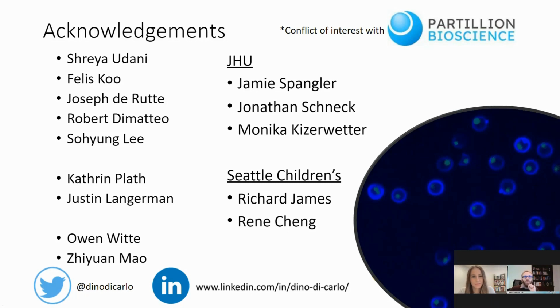Yeah, that's a great question. So normally when we are running assays in flow cytometry, we'll have calibrations for each of the fluorophores that we're using. If we're doing multiplexed assays, looking at cell surface markers and secretions, we'll have individual fluorophores that we do individual calibrations on to do compensation measurements.